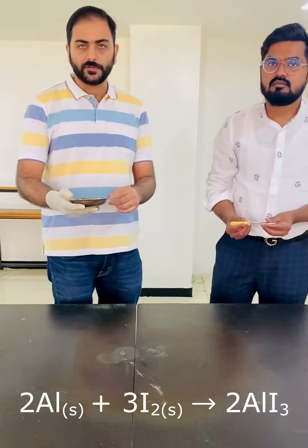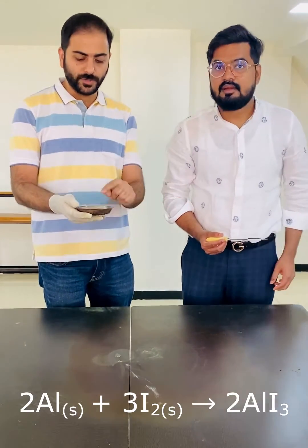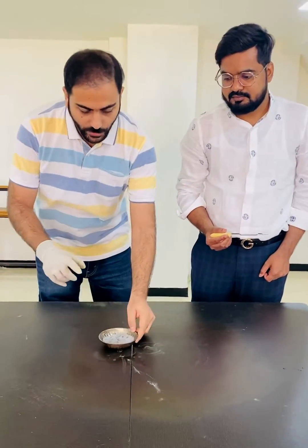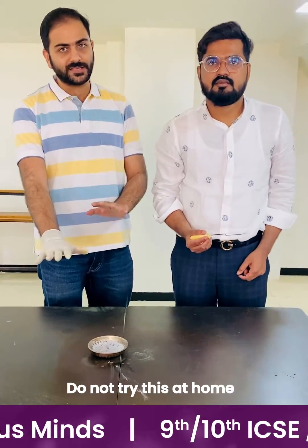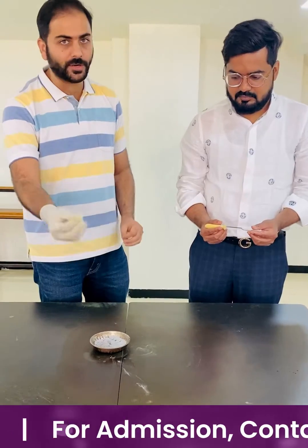We have already taken both iodine and aluminum into this container and mixed it thoroughly. We are going to add water into it to catalyze the reaction. Before starting, please don't try this at home. So we are going to add water into it and you are going to see what colored flames come out.